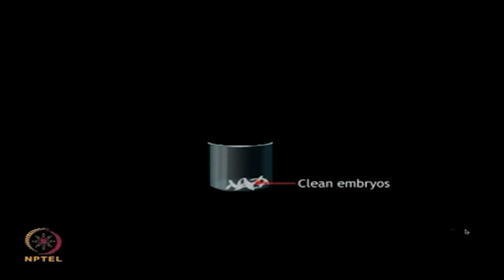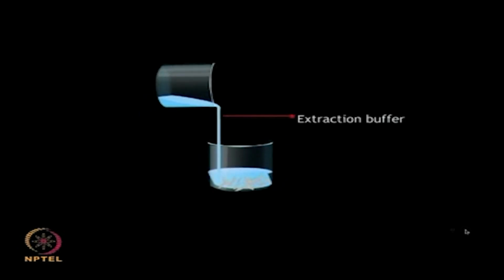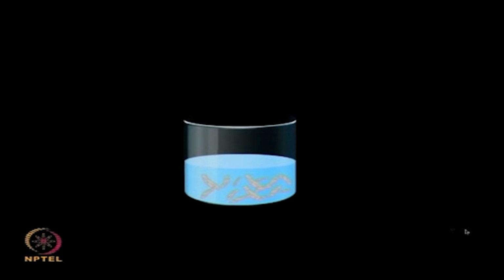Because the endosperm contains certain inhibitors of protein synthesis which must be removed. The selected embryos are washed thoroughly with cold water, after which they are mixed with extraction buffer and ground again.